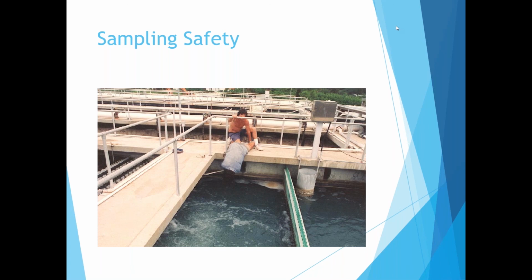Now, as far as NIST, yes, that thermometer needs to be NIST traceable. It does not have to be your $3,000 NIST thermometer, but it will have had at one point, been compared in the last year to a NIST thermometer, and there needs to be a record of that that says this thermometer number was compared to this NIST thermometer, and they read this much apart.